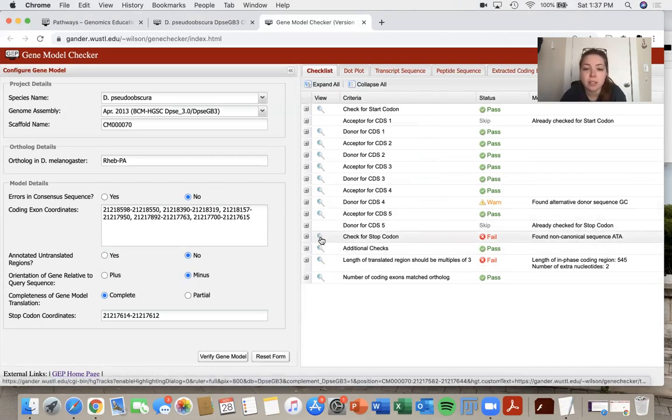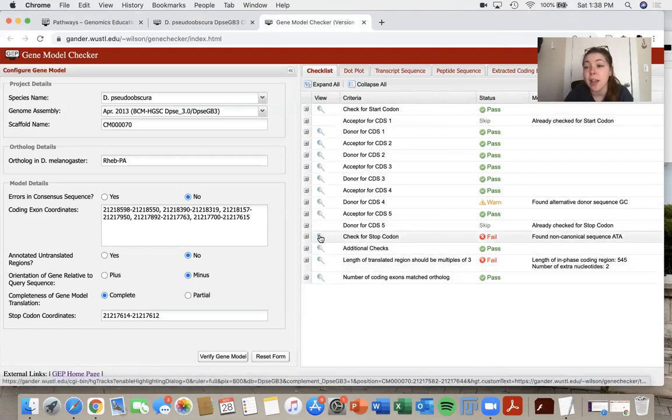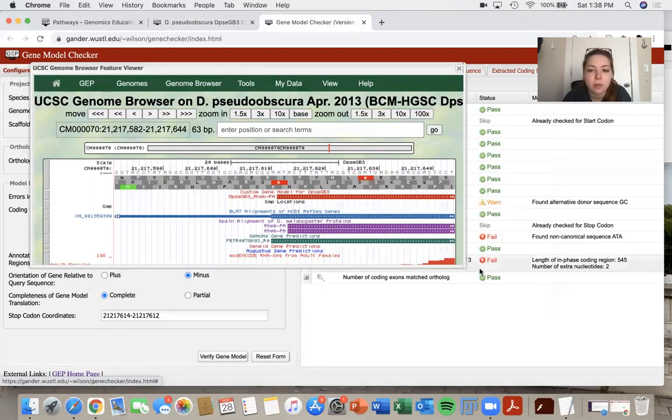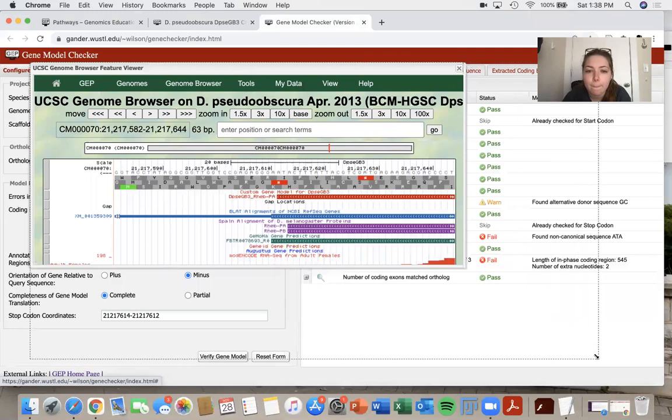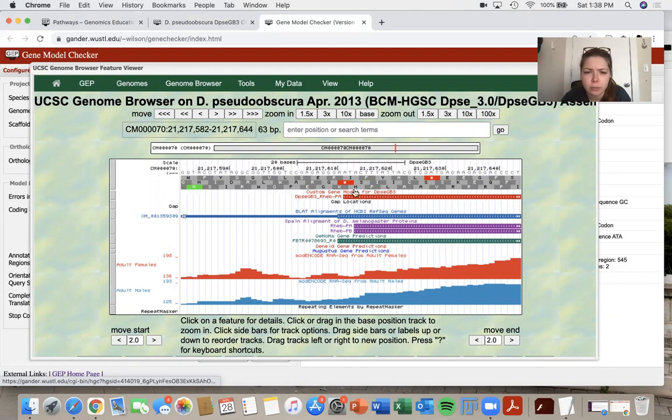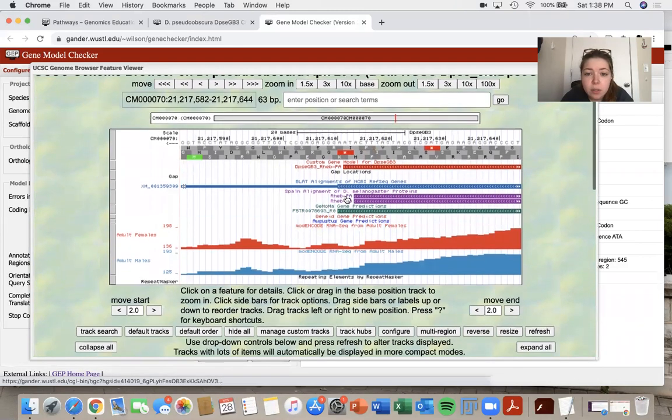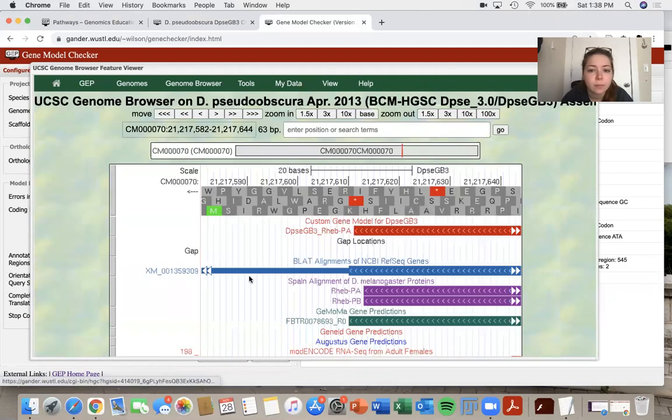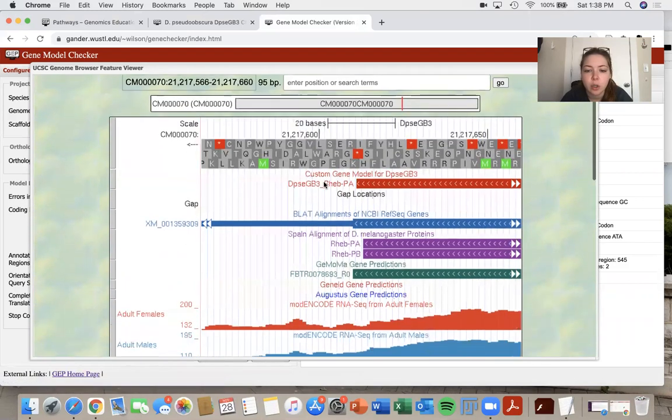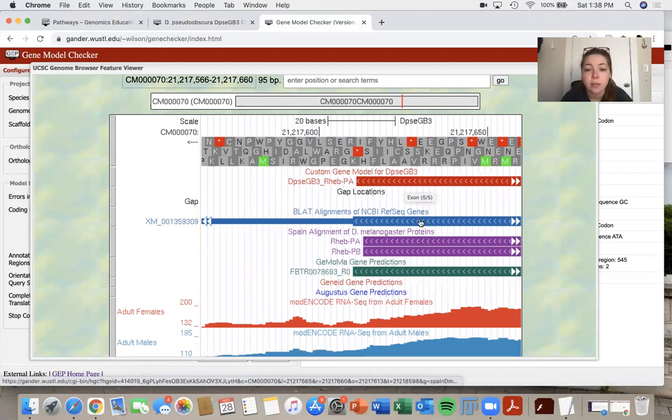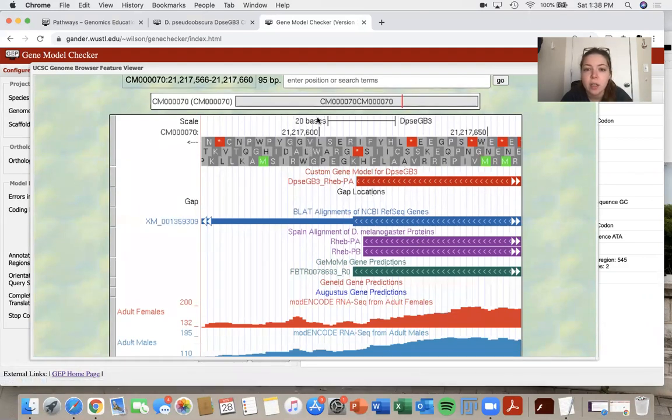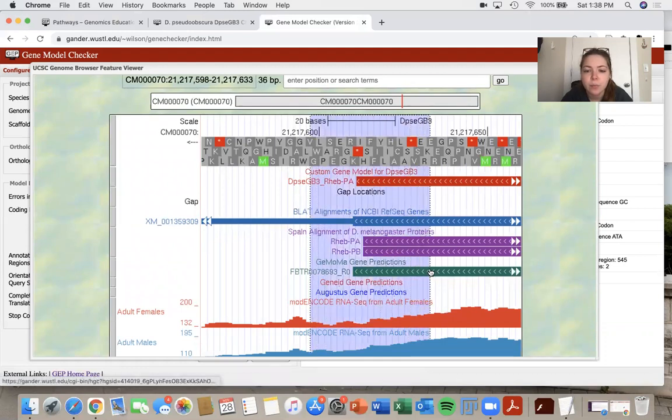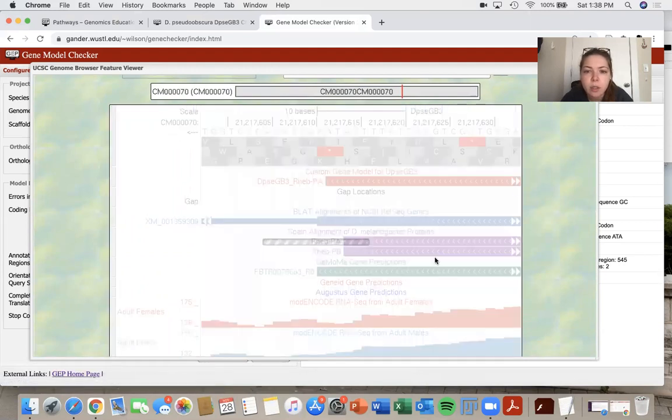So the little magnifying glasses that you see under this view are very convenient and they will take you exactly where your error is. So if I click on it, I can make this browser a little bit bigger and I can determine what is going on. So our gene model at the top is the one that we wrote in with our coding exons. These are some other tracks. So I want to zoom in on my model and see what exactly did I do.